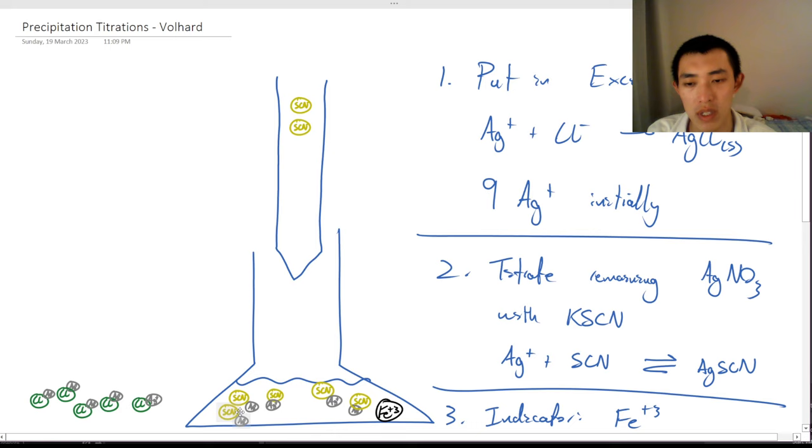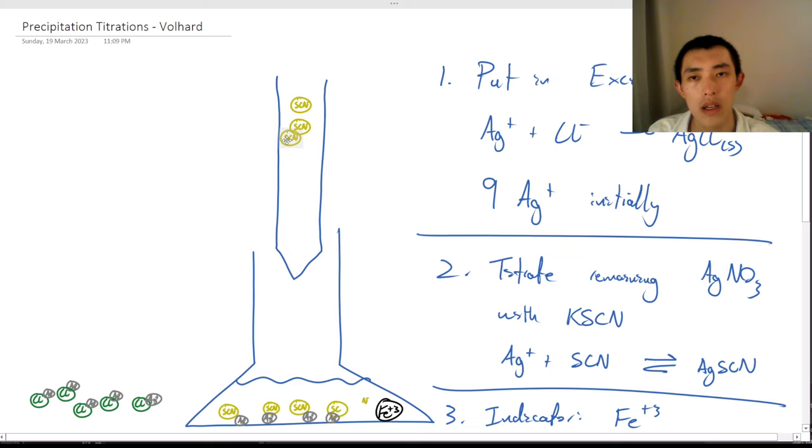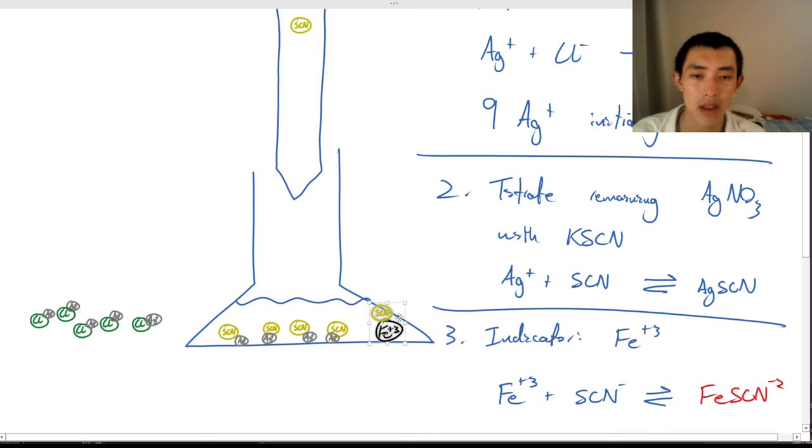The thing is, we don't know to stop yet, because there's nothing to tell us to stop. So we're actually going to keep going, because our indicator hasn't flashed yet. Now, because my thiocyanate and my iron have bonded together, we remember that that causes a color change, so it becomes red. This is actually going to become red like that. Fantastic. And so now we need to stop.